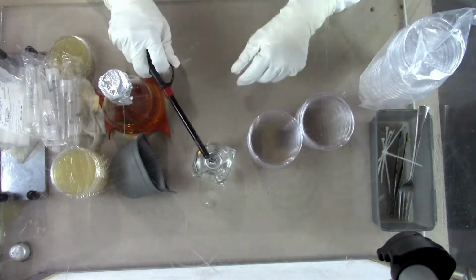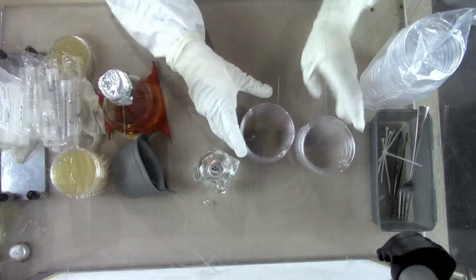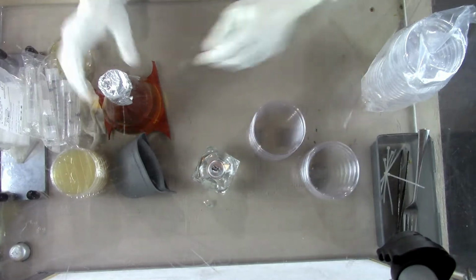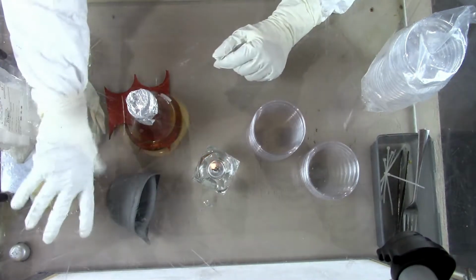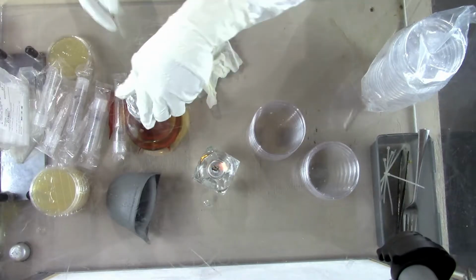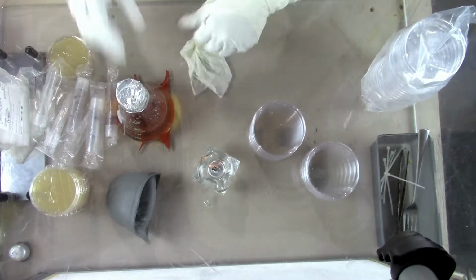There are two ways to get those agar plates. Either you buy them already done and solid, sterile, or you can buy the empty petri dishes, as you can see on your right side of the screen, and then you have to make your agar and pour it on those plates. So this is the way that you do it.